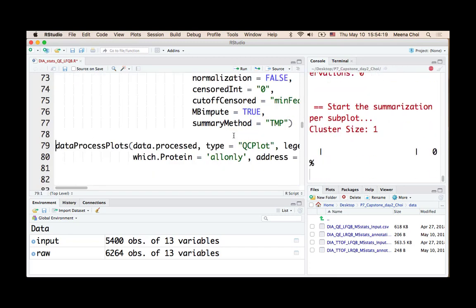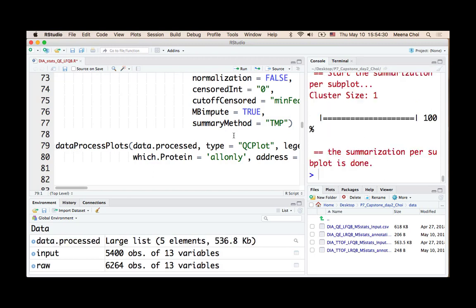So if you were using not just these 11 proteins, but the whole proteome, you would normalize based on the median? So you mean that our default option, equalize medians? Yes, across the whole proteome. Yeah, but just because it's a small subset. Here it's only a subset. In this data, we have only 11 proteins, right? So we are not going to do this.